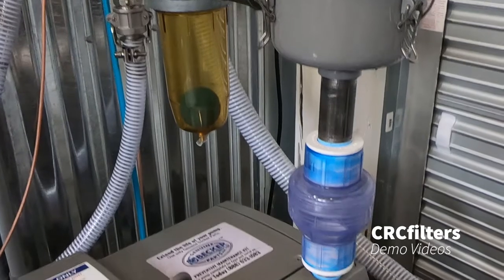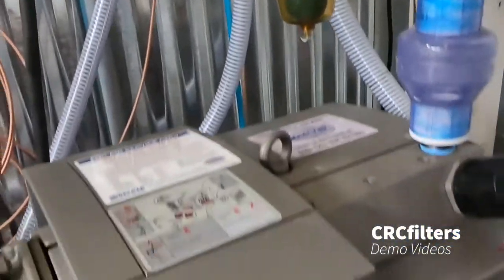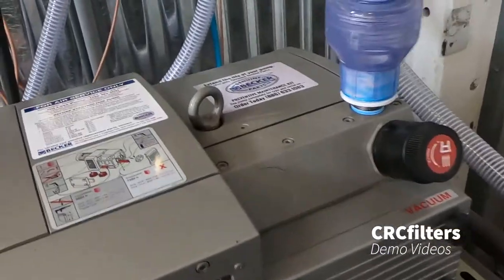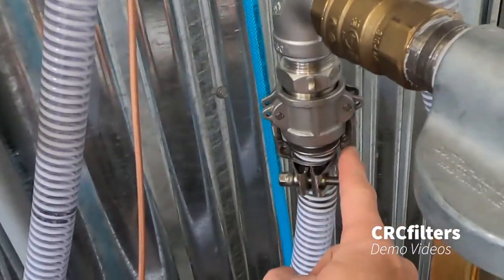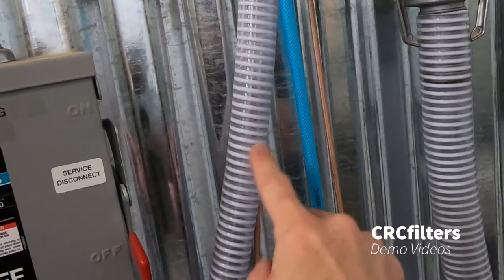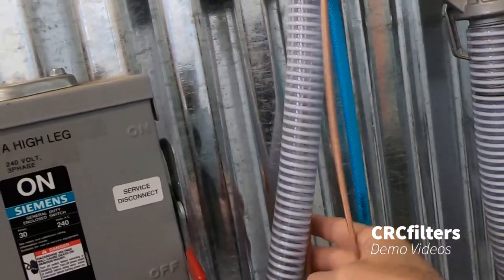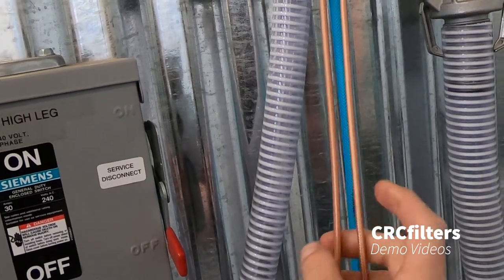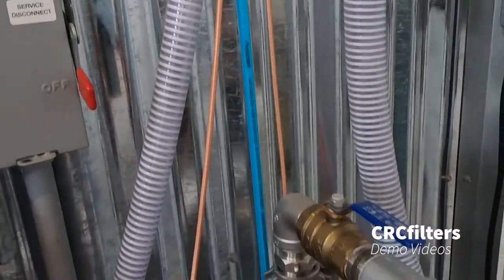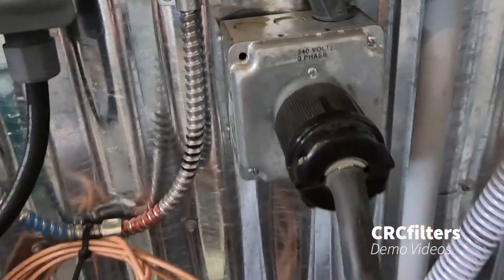We've got our filter check valve right here to keep any backflow when you shut the system off. We've got a safety ball float. We've got our exhaust that runs to the exterior of the building and that runs overhead. Over here we've got our vacuum line that loops around and runs overhead over to the extractor system. We've also got our air line to operate the lift, which runs over to the extraction system. And then we've got our two transducer lines right here that operate the transducers — these connect into the generator. This is 240 three-phase, which is what operates the vacuum pump.